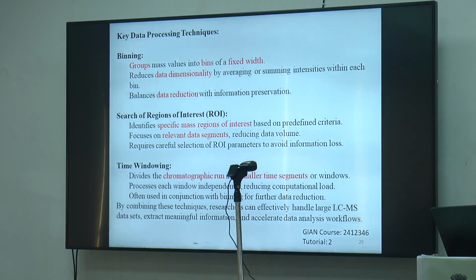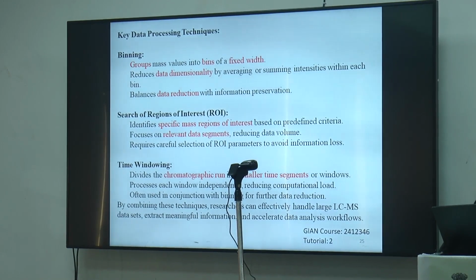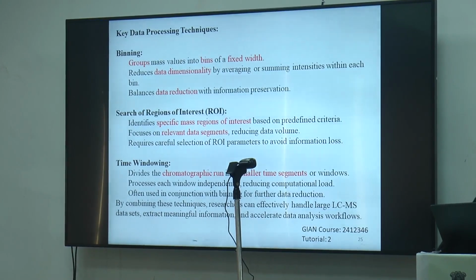So for the data compression, you have to go ahead with the 3 steps. You can use the 1 and the 2 simultaneously, you can use the 1 and the 3 also simultaneously, but they have different applications.